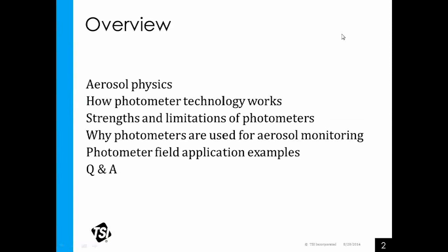As an overview, we're going to start with some very basic aerosol physics. I can't cover a lot of it here. A lot of it goes way over my head. There's a lot of PhDs in the building here at TSI who can explain it better than I, but I'll give you a simple overview of how some of the aerosol physics works with respect to how our instruments use that for measuring. We'll talk about how the light scattering photometer works, and then get into the strengths and limitations of these instruments and why they're used, and then have some field examples of customer examples of what's been successful. And we do have time at the end to do some question and answers, so we'll get most of your questions answered by the time we wrap up.